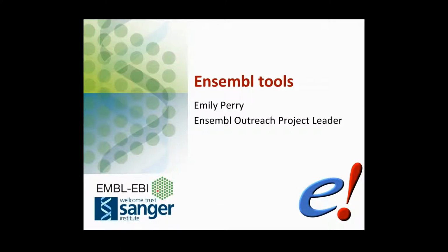My name is Emily Perry. I'm the Ensembl Outreach Project Leader, which means that my job is to, in various different ways, teach people how to use Ensembl and different features of Ensembl, which partly means doing webinars like this, doing live courses, and making some of the online training materials that you can see.